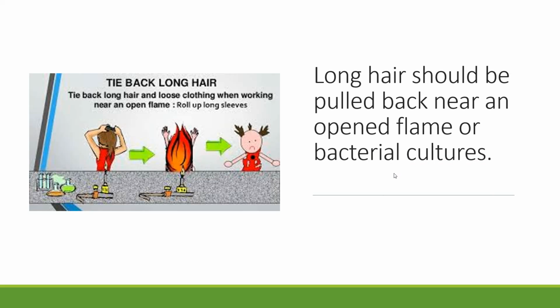Recognize too when you're working in lab settings that if you are on site, there has to be proper dress code. You would wear closed-toed shoes, you cover your waist, you don't wear sleeveless shirts and things like that. But you also have to make sure your clothes are not so loose and that your hair is pulled up, because when you are working in a microbe lab in particular, a lot of times you're using what's known as a Bunsen burner and it's got a flame, and loose clothing or loose hair can actually get caught up in that Bunsen burner and cause a safety hazard for the student.